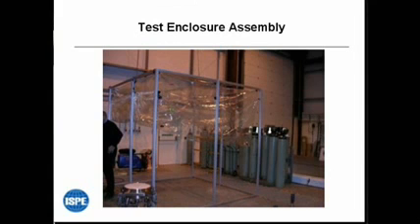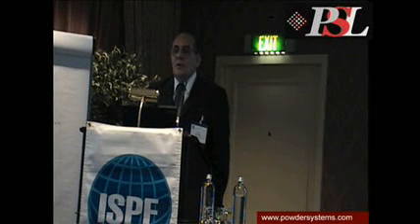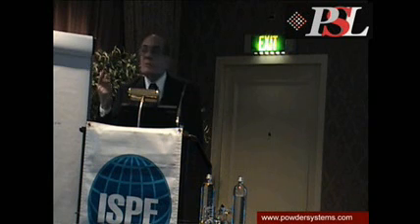Extruded aluminium, 12 foot high, 8 foot by 8 foot wide, so we know the volume of the space. Roll the equipment in, charge the equipment, roll the walls down, isolate it, run a background. We run every location that we're going to sample as backgrounds, not one, because there's enough variability in a room that may have been exposed to lactose from a previous study. You want to be sure that you know what the background is.